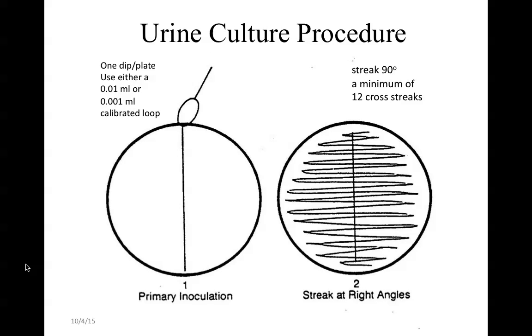For the urine culture streak technique, we're actually going to perform this technique in the laboratory with fake or artificial liquid cultures or liquid preparations. And to do a streak technique, we're going to take a loop full of bacteria, streak it right down the center of an agar plate. That was called the primary inoculum.